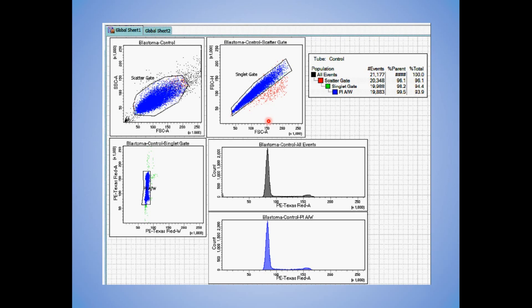Forward side singlet and I've got varying gating structures here. This one's on all events, this one is through the area and width plot. I'm not going to get into the weeds about when to use which and when not to. The data is relatively clean so I would probably go with something like this.